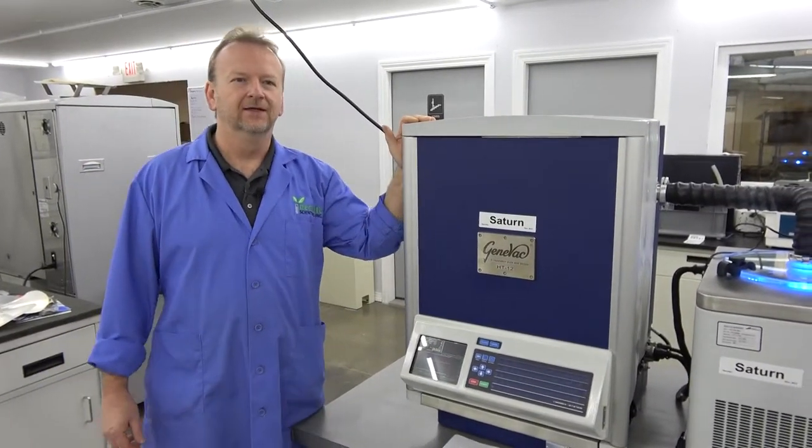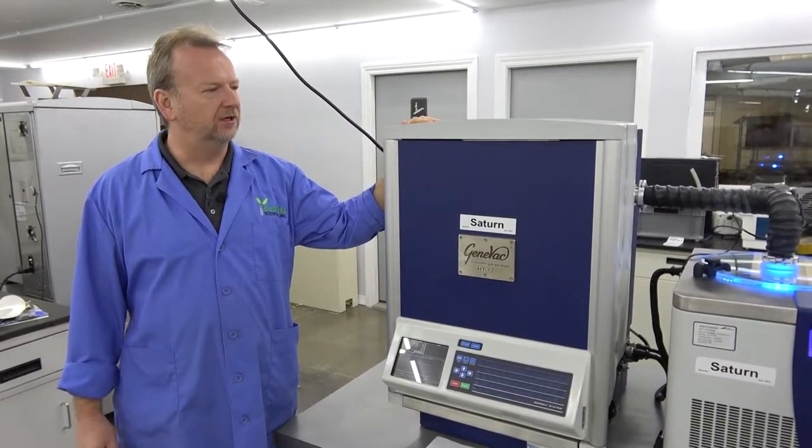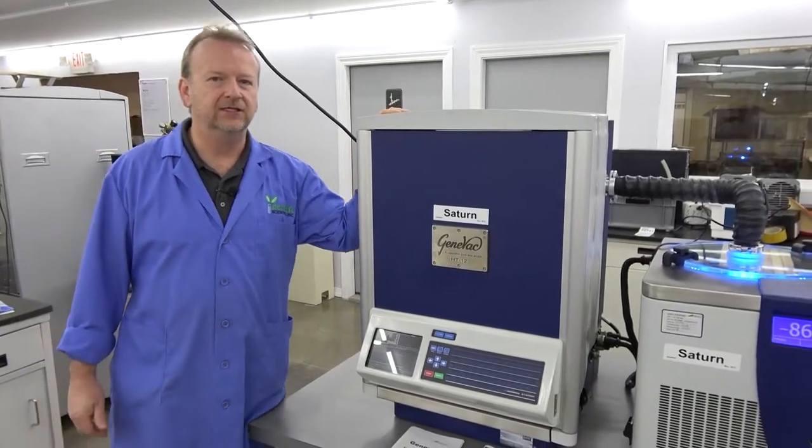Hi, I'm Rich with New Life Scientific, and today I want to show off this beautiful Saturn Genevac HT12.